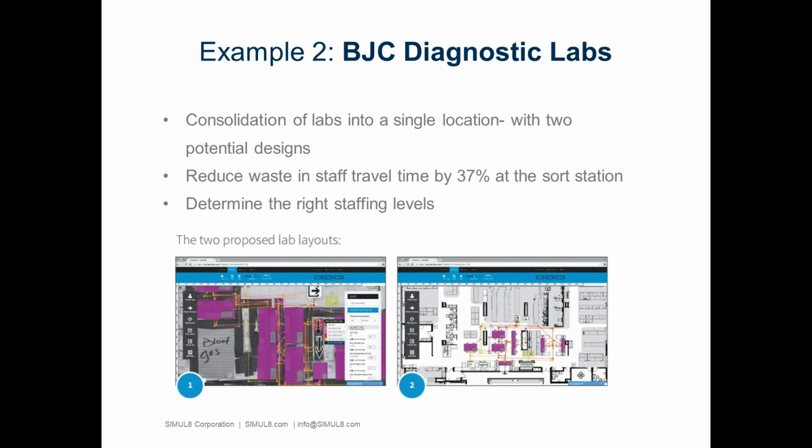When we looked at this, we found that there wasn't a huge difference in terms of the best capacity to choose, but getting it towards 10,000 capacity was where we saw the most efficient use. So that could steer which capacity works best in this configuration. If we have any more capacity, it's probably not going to help the system at all. And those are the types of results you can use to help decision making.